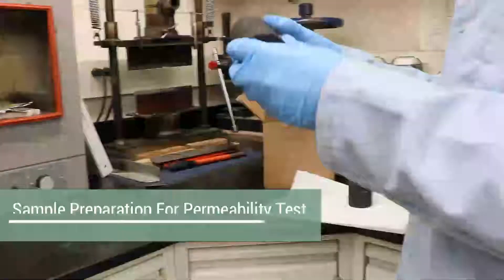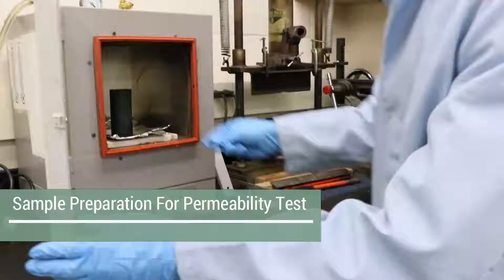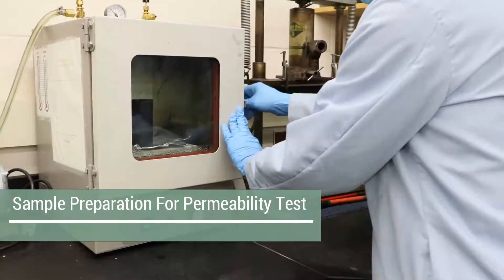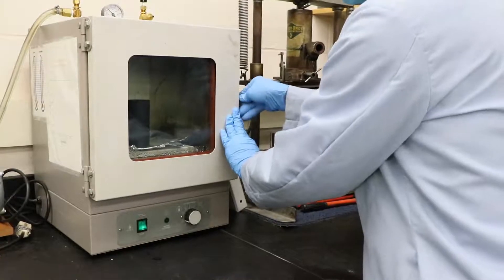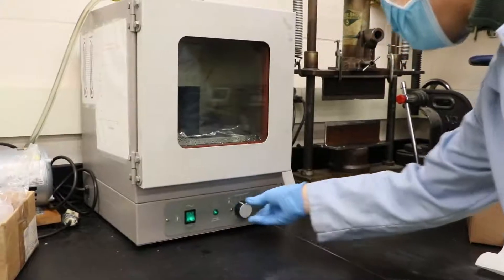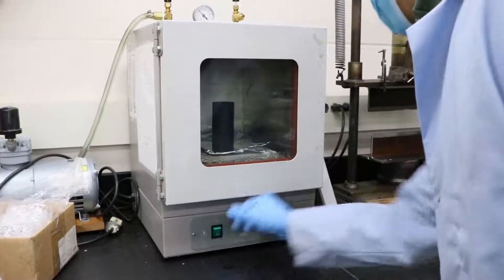Permeability test methods. First, we prepared the cylinder core with a dimension around two inches in diameter and four inches in length. Both ends were trimmed and polished to ensure the parallelism. Then we put the prepared sample into a vacuum oven to dry for 12 hours under the prescribed temperature of 120 degrees Celsius.